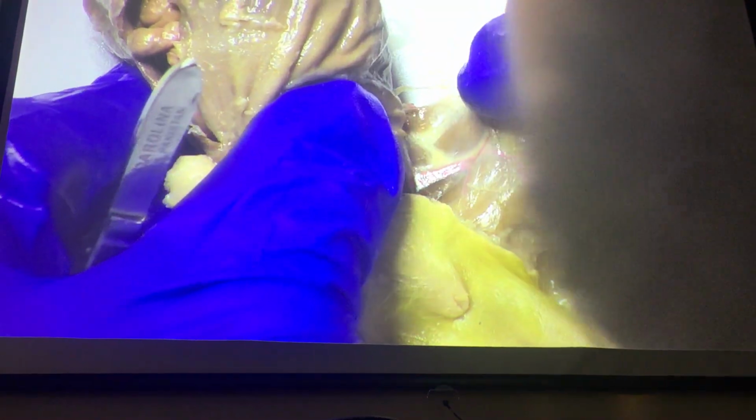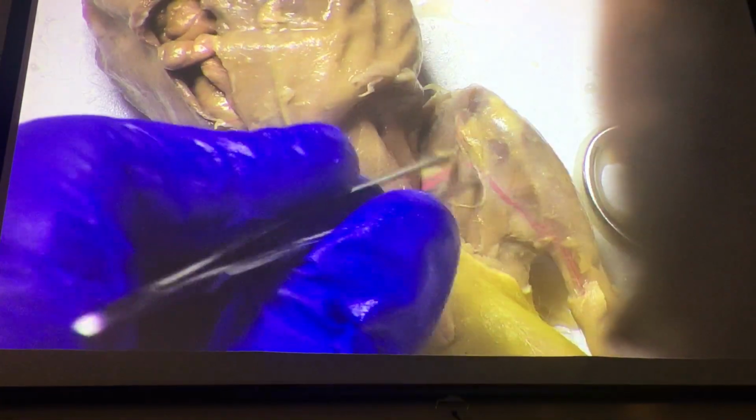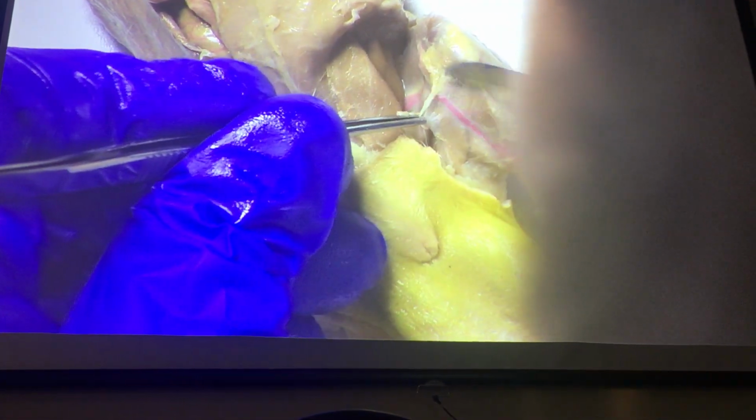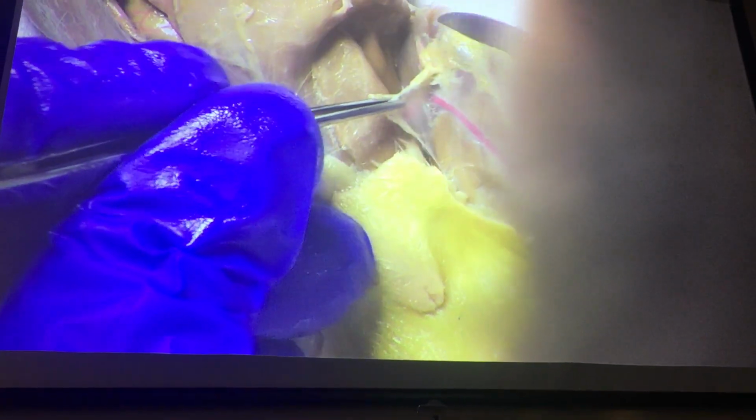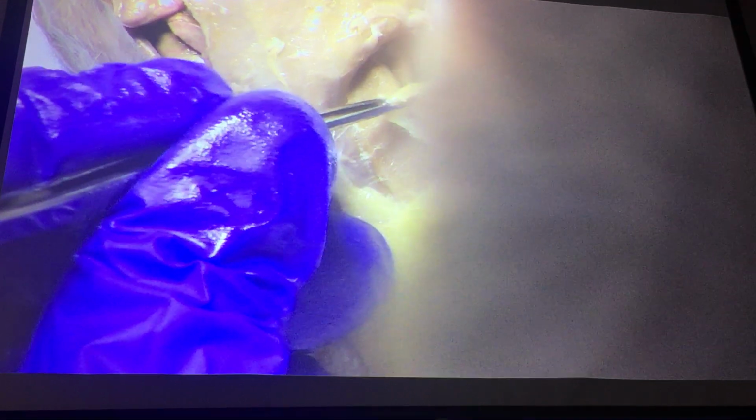And they're going to be harder to see on a male than a female because you've got the big patch of genitals in the way. So as we come in here, you can see that one layer of fascia, fairly thin compared to what you've been working with so far. So you've got to be really careful here. You don't want to lose these muscles as you go.